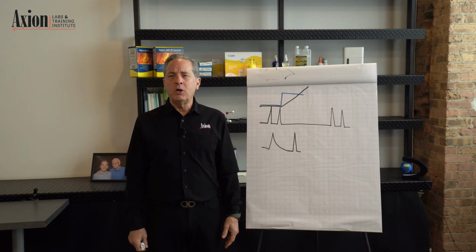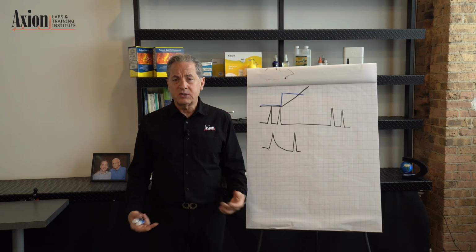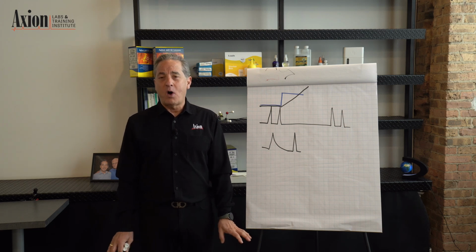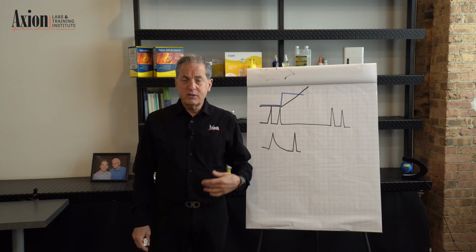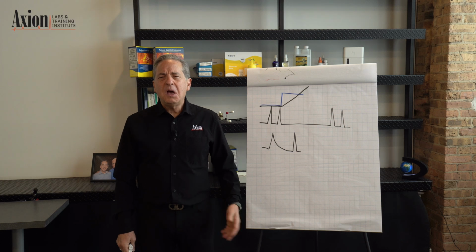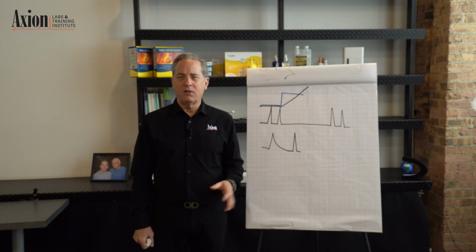The first thing we're going to do is you're running your HPLC. I usually like to have methanol water or acetonitrile water. The first step is we're going to go to a high percentage of water. I know it sounds backwards, but we're going to go to 90% water, 10% acetonitrile, or 10% methanol, whichever one you're using. And this water is just pure water, no buffers or anything in it. We're going to wash with that for 20 minutes, 1 ml a minute, and that's going to get rid of all the salts, all the buffers, get all of them off your column.